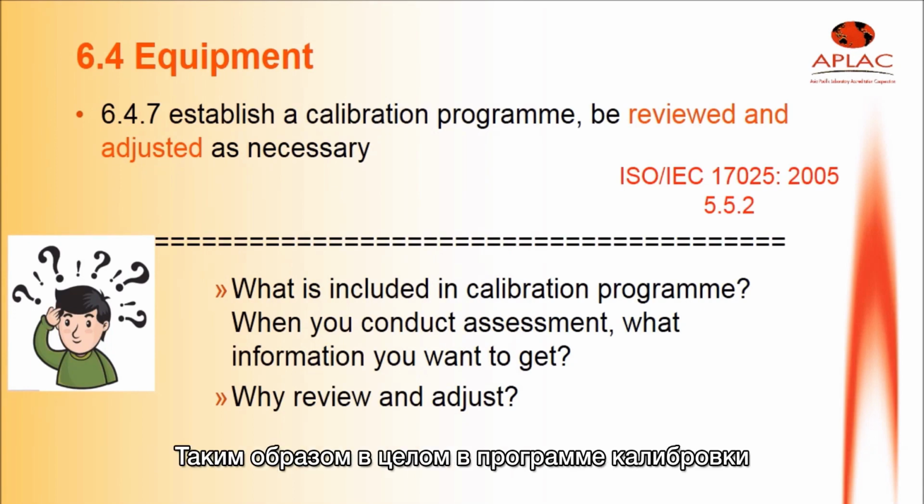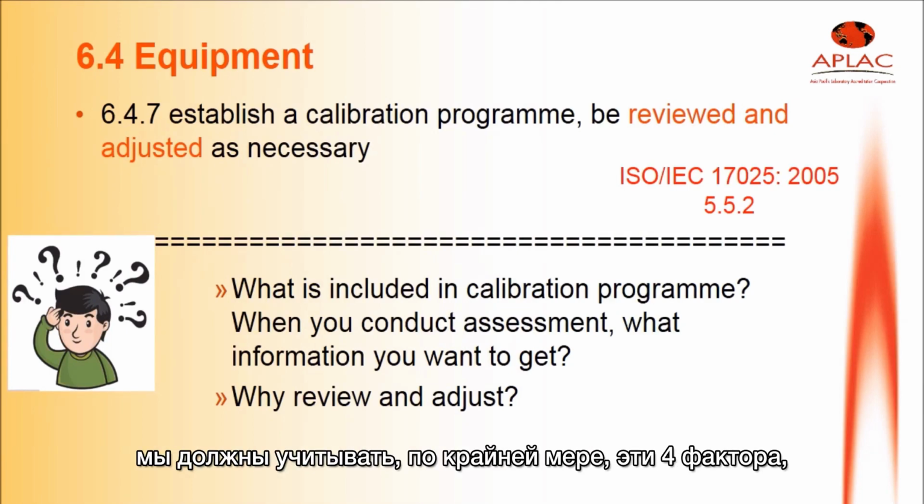So generally, in the calibration program, we have to consider at least these four factors.